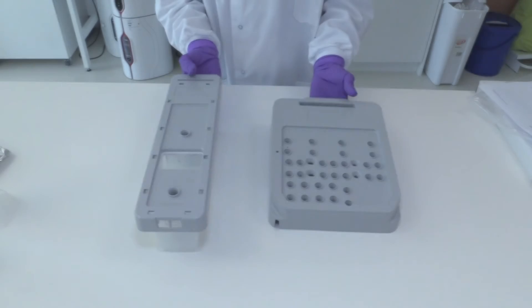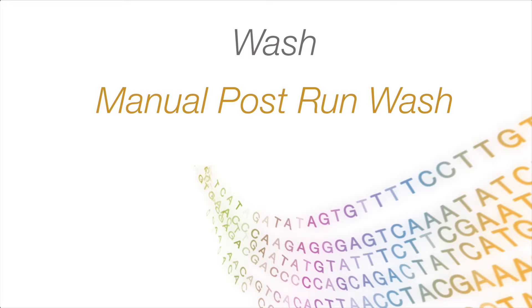Now load both the wash reagent cartridge and the wash buffer cartridge with a used flow cell on the NexSeq to start the quick wash.